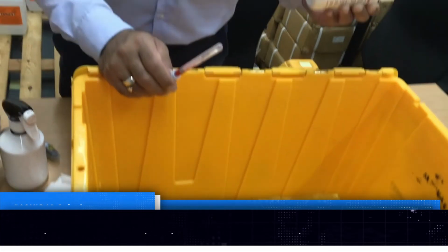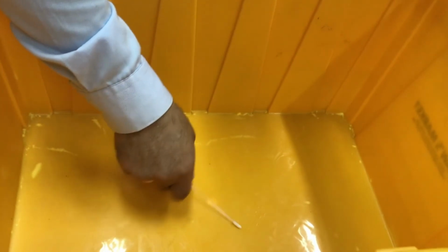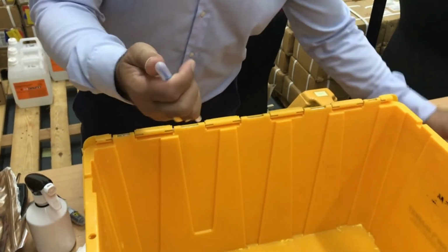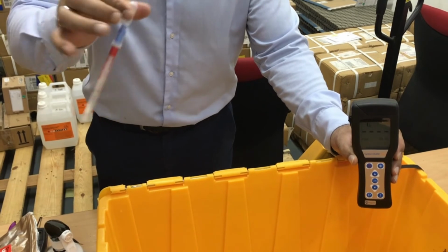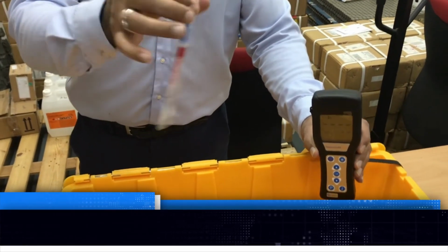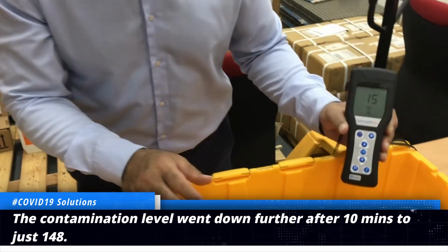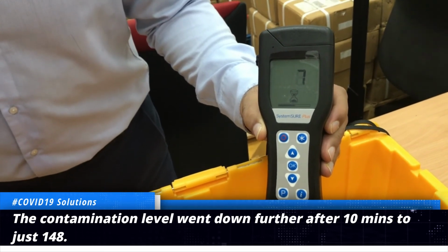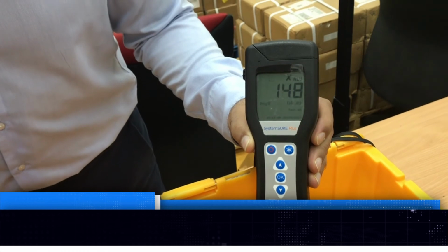And we will measure now Waterliq in its strength. Again, 10 by 10. Put in, break, and shake. After 5 seconds, open the ATP meter, put it in, and start reading. Went down.